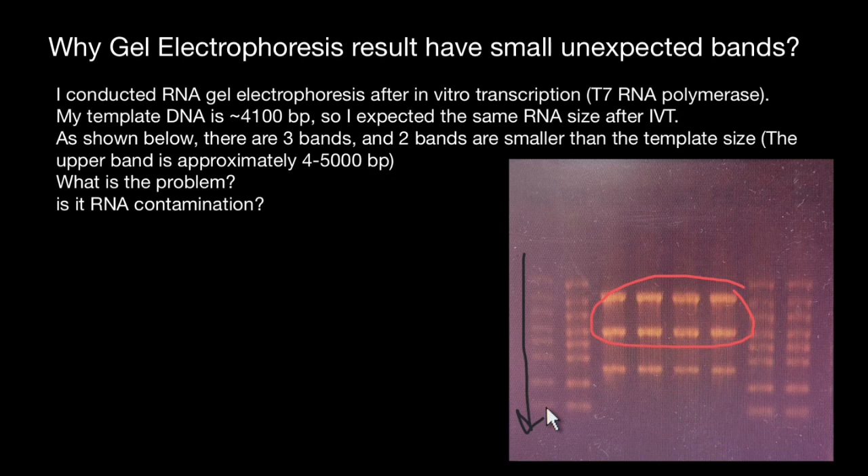If you're observing unexpected smaller bands in your RNA gel electrophoresis, there are several potential reasons. The first one would be incomplete transcription. These smaller bands can be the result of incomplete transcription, where T7 RNA polymerase may terminate prematurely, resulting in shorter RNA fragments.